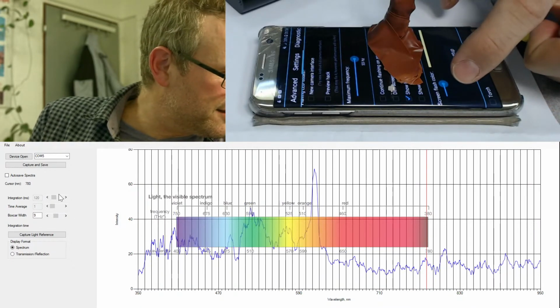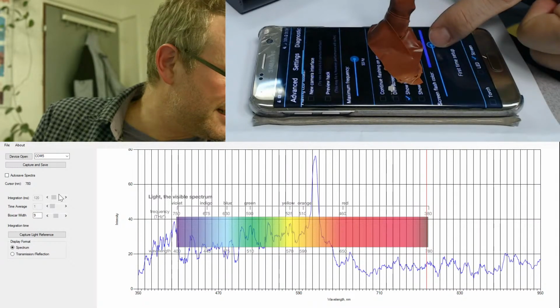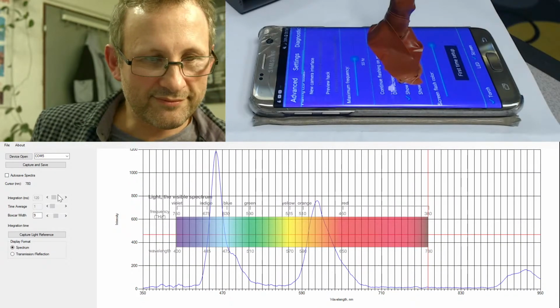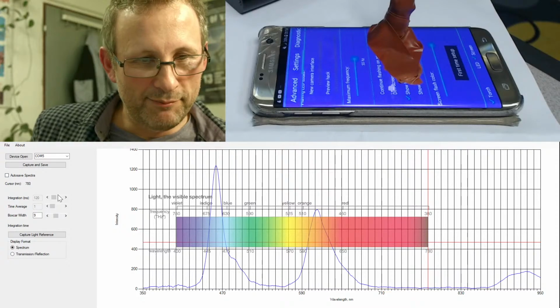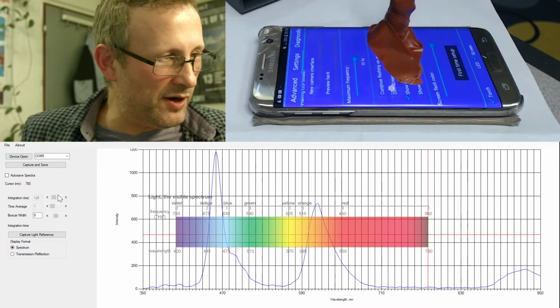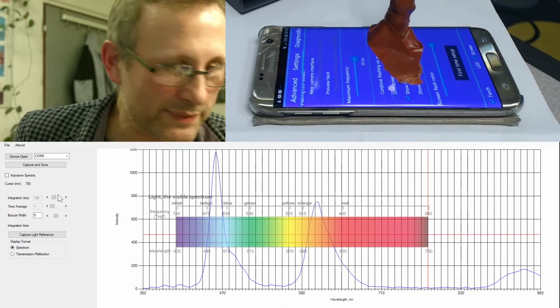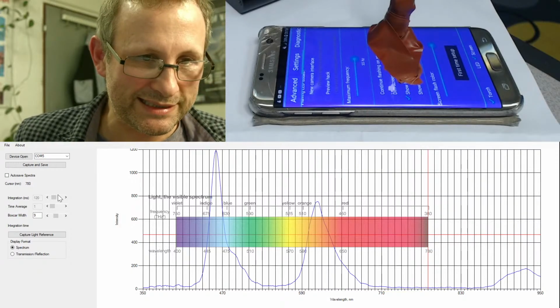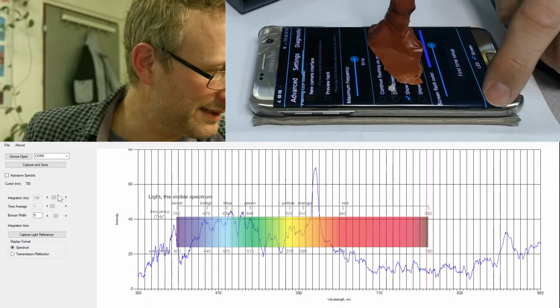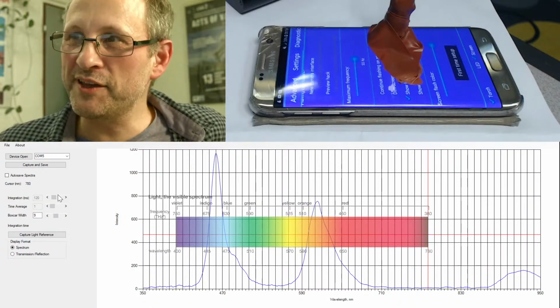And then I'm going to change to, let's try some purpley color like this. What do we see? There we go. So we've got some blue and red in there. And this is really, really purple to the eye, but it might be an angle thing with the CCD on the webcam that's making that look blue. But I'm telling you, this is purple. Maybe you can see it's purple. No, you can't even see it's purple there. But anyway, it's purple. I'm telling you it's purple. It really is purple to the eye.